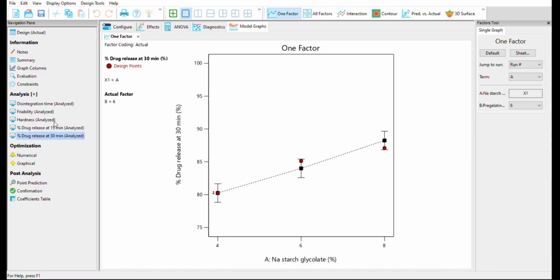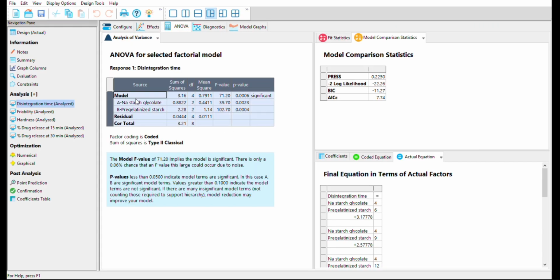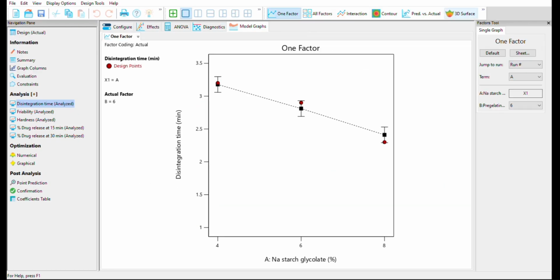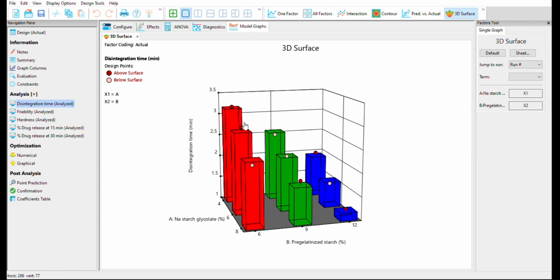Now I'll show you how you will save the data, because it's important. Right click and copy. You can also export the table to Word. Just copy and paste into Word. Okay. Now I will also show you how to download the figure. Not download, just how I will generate this.